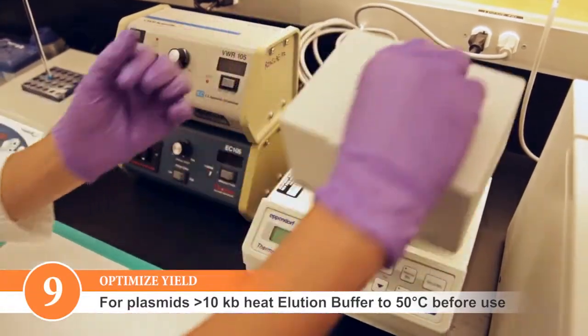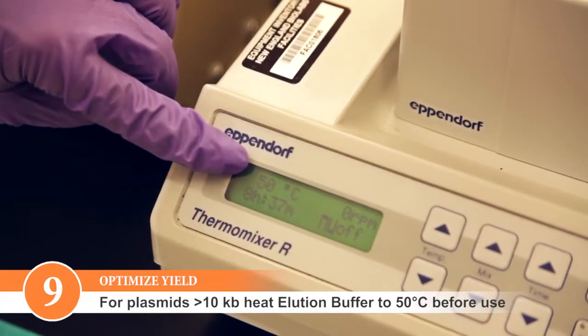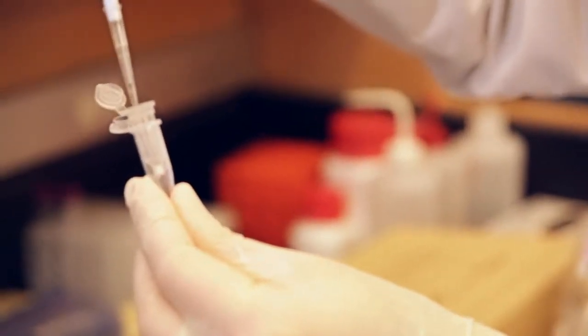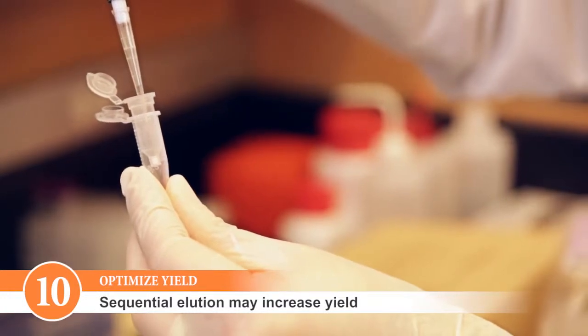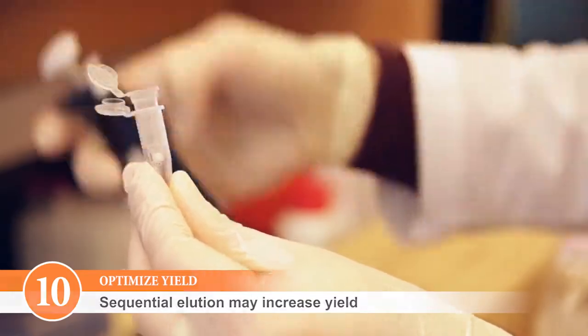For plasmids that are larger than 10 KB, heating the elution buffer to 50 degrees Celsius prior to adding it to the column can improve yields. Please note that sequential elutions may be performed for quantitatively higher recovery, but will result in lower final DNA concentration.